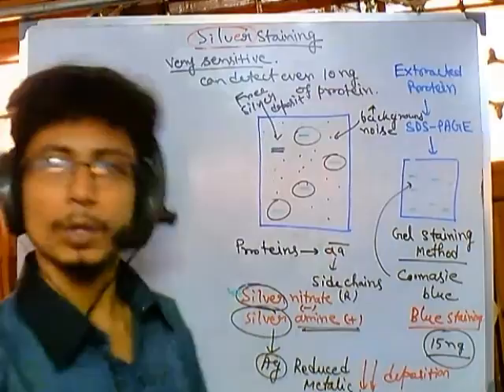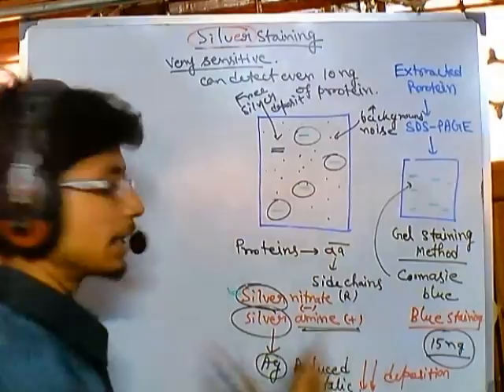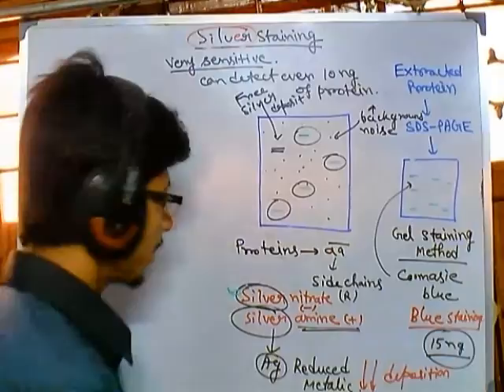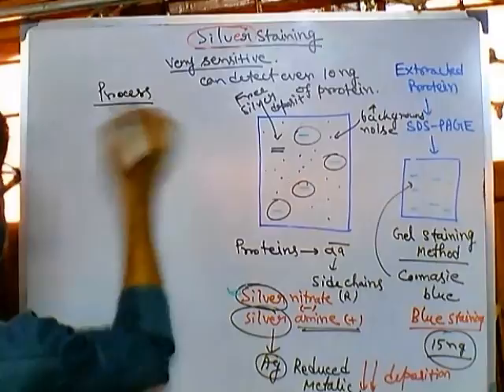So we take the gel out, add this solution and rinse it, then fix it, develop it, and we get our desired result. This is the process of silver staining. Let me write the step-by-step process of silver staining. I won't recommend you memorize it, but this is the basic principle you must know. Now the process is something like that.